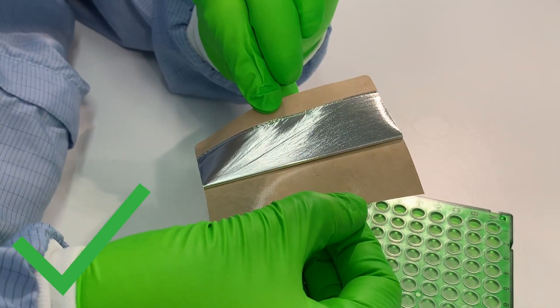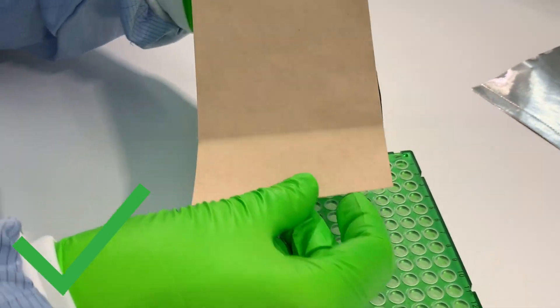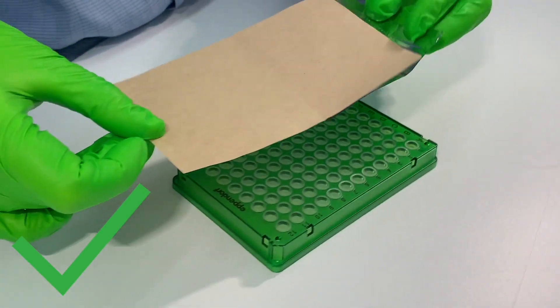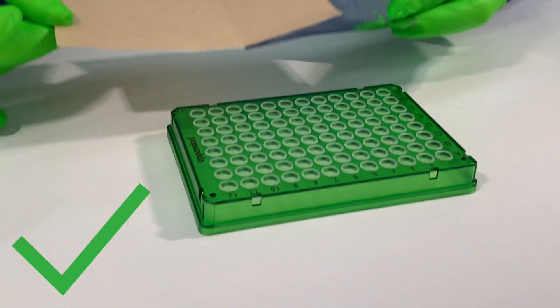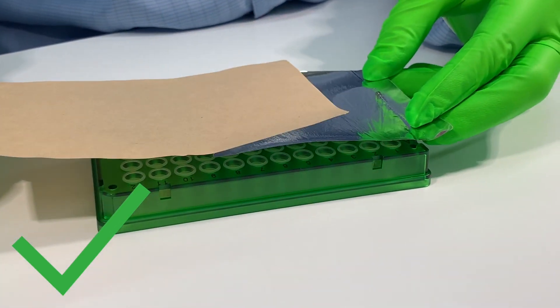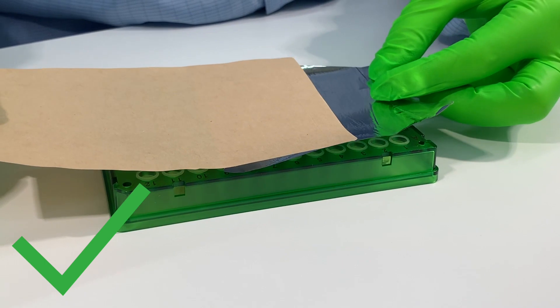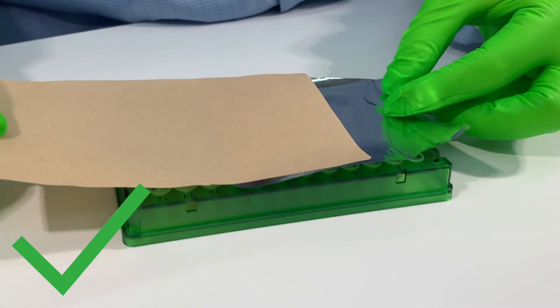Turn the seal so that the sticky side faces the plate. Place the seal in a way that the perforation is along the edge of the plate. Try to place it as straight as possible.